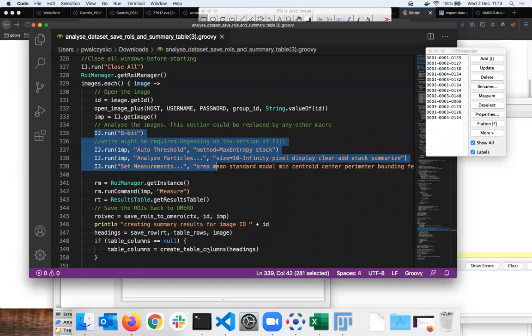Here, you run the macro line by line. But if you already have the macro as a file on disk or an attachment, you can just say run macro, and then you will apply the macro to the image. What you do in the notebook that Peter wanted to show is something a bit more user-friendly than that, if you're not familiar with the scripting facility.